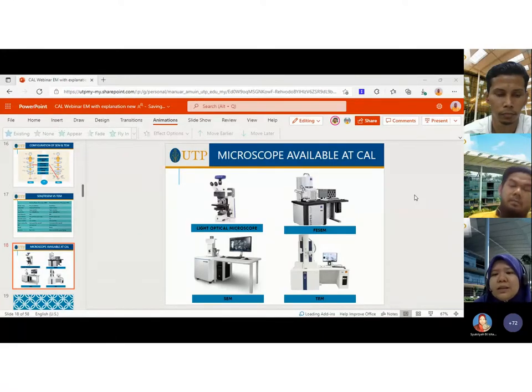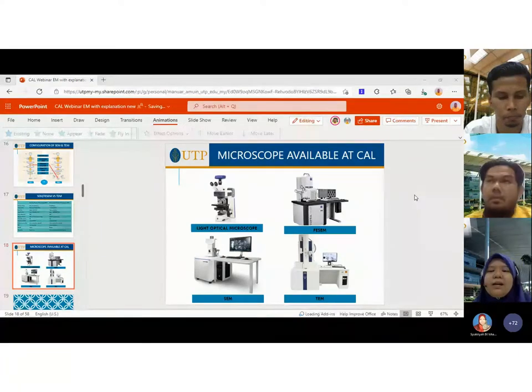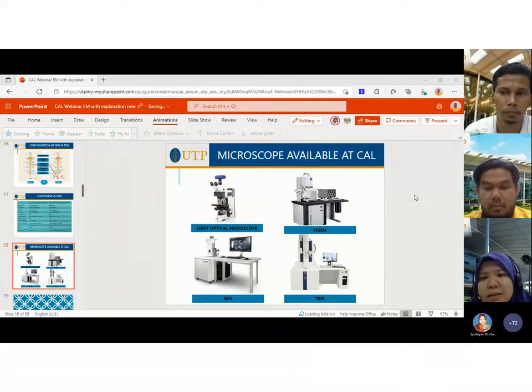To reduce the time for the vacuum procedure. And normally in one session, we do not put only one sample. We can put 4 samples, so it will save time because we don't need to put in, run, vent down, take out the sample and put in another. So normally, one session we put all 4 samples so that it will reduce the time for analysis.